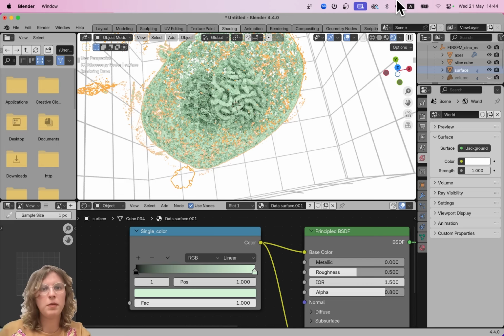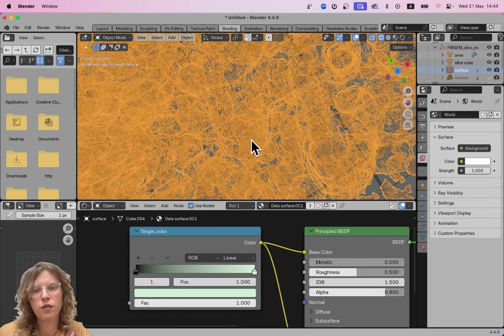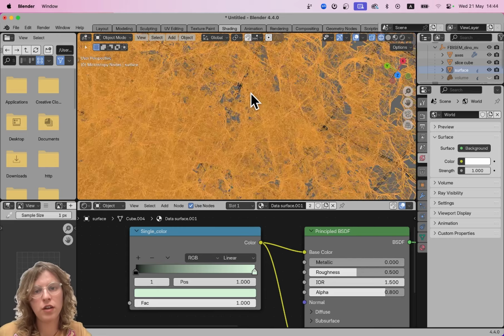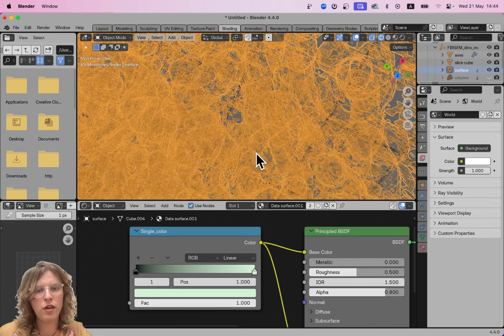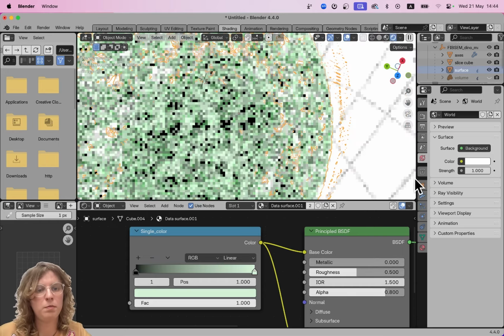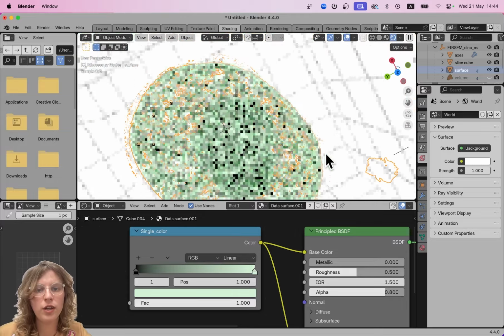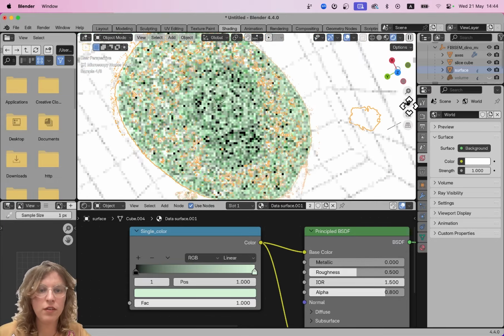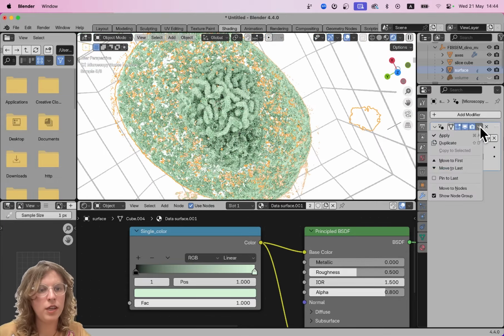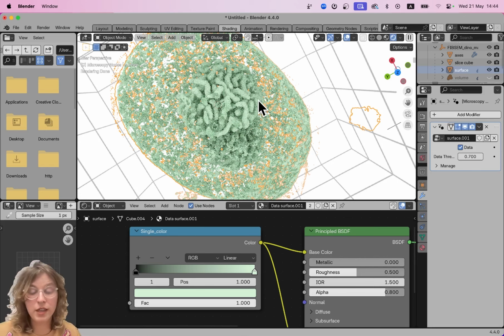You can also do some mesh editing, because what this actually is, is just meshes, which are like nodes with attachments that we draw a surface in between. And with Blender's mesh editing, you can do quite some tricks to get this. So you would need to apply the Microscopy Nodes modifier, and then you can do mesh editing. But this is very complicated, and I won't really get into that.